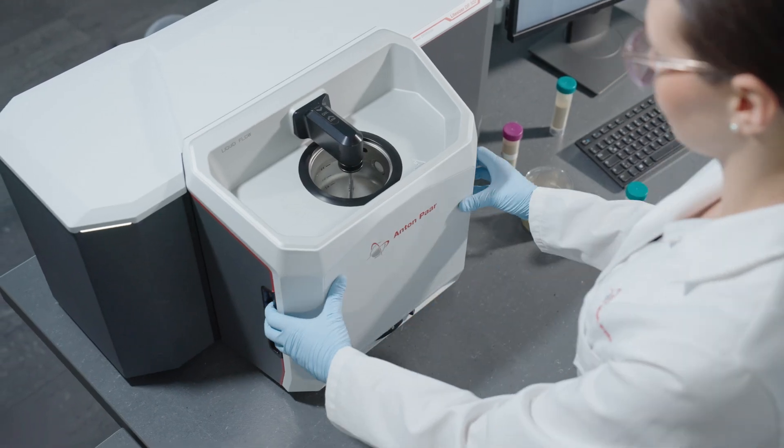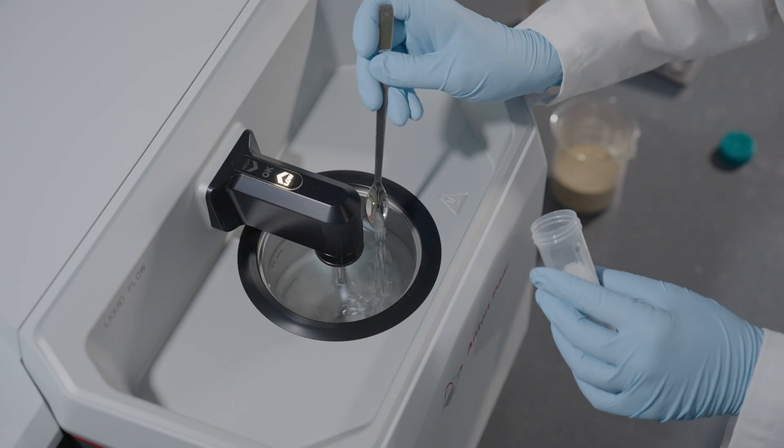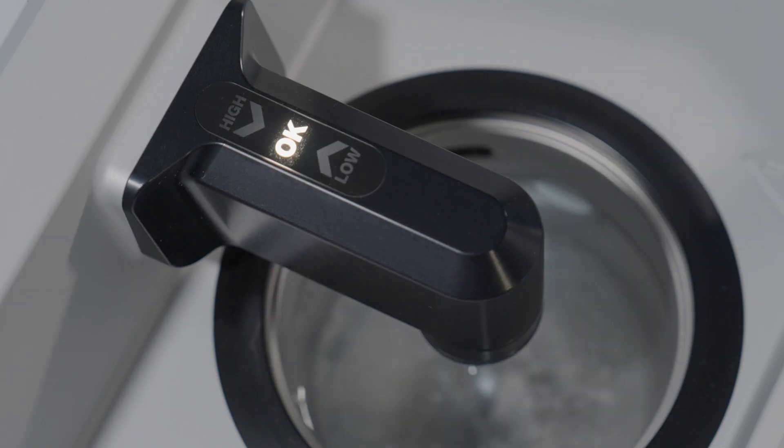The dispersion units can be switched in one move, and the Obscuration Level Indicator lets you monitor and adjust your sample amount directly at the instrument.